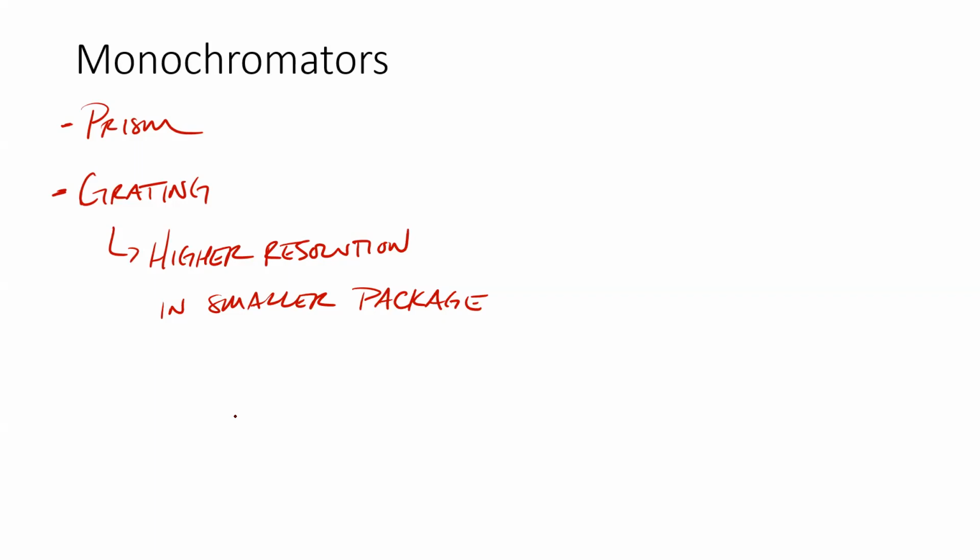As you saw in the Lambda Max figure last time, that one had a bandwidth of 6 nanometers. On the exam yesterday, our UV-Vis had a bandwidth of 4 nanometers. Did you get that one right? And so these kinds of bandwidths are pretty standard for UV-Vis.